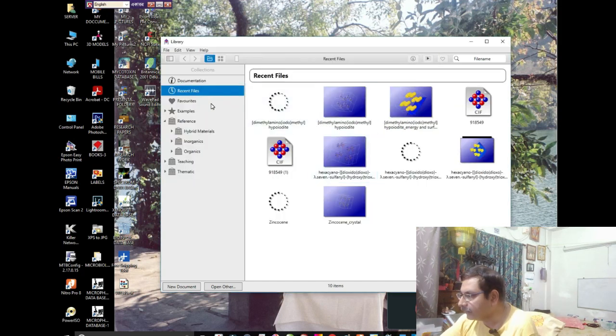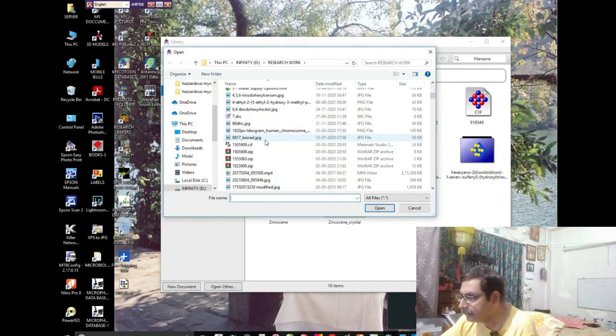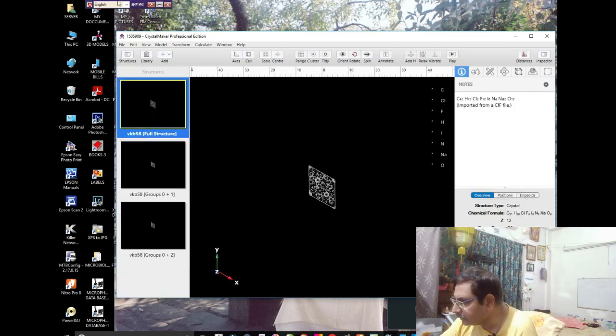We will open Crystal Maker. So just open in the format of CIF, and then this will open. So definitely it should open. Let me see. So it is opened. Now you can see the crystal file.